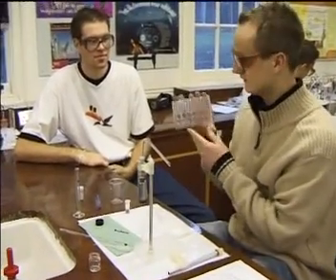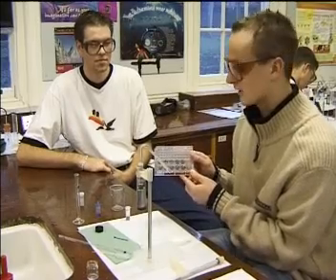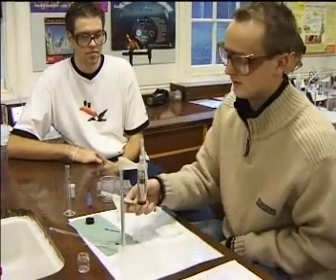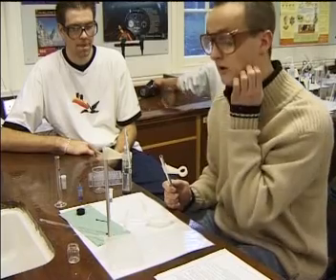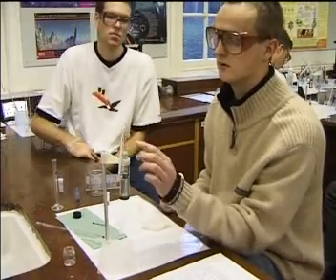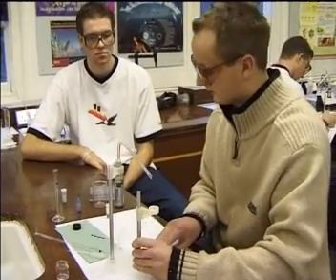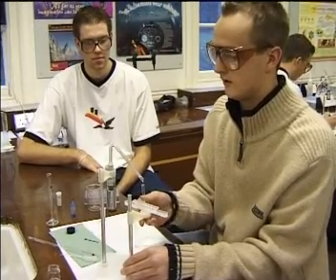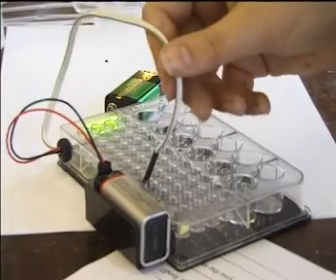Well, this is a combo plate, and it's basically used instead of beakers, and you can put your test tubes in here, and so you can do everything on a smaller scale, which is obviously more economical. But it can also double up as one of these, which I'm setting up to distill this product in here. Basically, we've got some oil here which is going to indirectly heat the compound I've got in here. It's going to come across, and as it goes through here, it's going to condense again, and then I'm going to collect it in this test tube here. And obviously the benefits of using something like this is you can do everything on such a smaller scale. It's just safer and more economical.